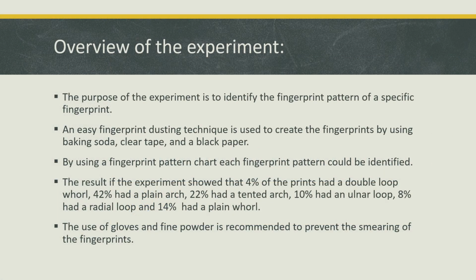The purpose of this experiment is to identify the fingerprint patterns of a specific fingerprint. An easy fingerprint dusting technique is used, as well as a fingerprint pattern chart to identify each fingerprint pattern. An in-depth overview of the results will be shown later in the presentation. We recommend the use of gloves and fine powder to prevent the smearing and smudging of the fingerprints.